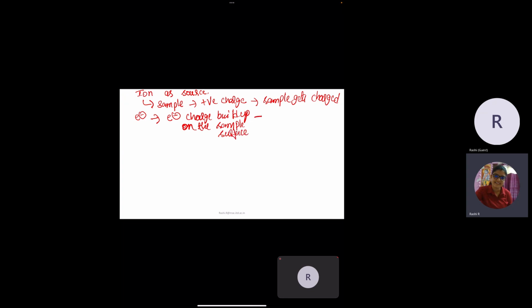Thus, as I showed in one of the previous interaction classes with a powder sample, if you are scanning at a lower scan speed, we could see that it was brighter in a few areas and not as bright in other areas, because that bright region is mainly due to electron charge-up and charge issues being present. The bright image will not be able to resolve properly, image shifting will happen, and the resolution will be very bad.